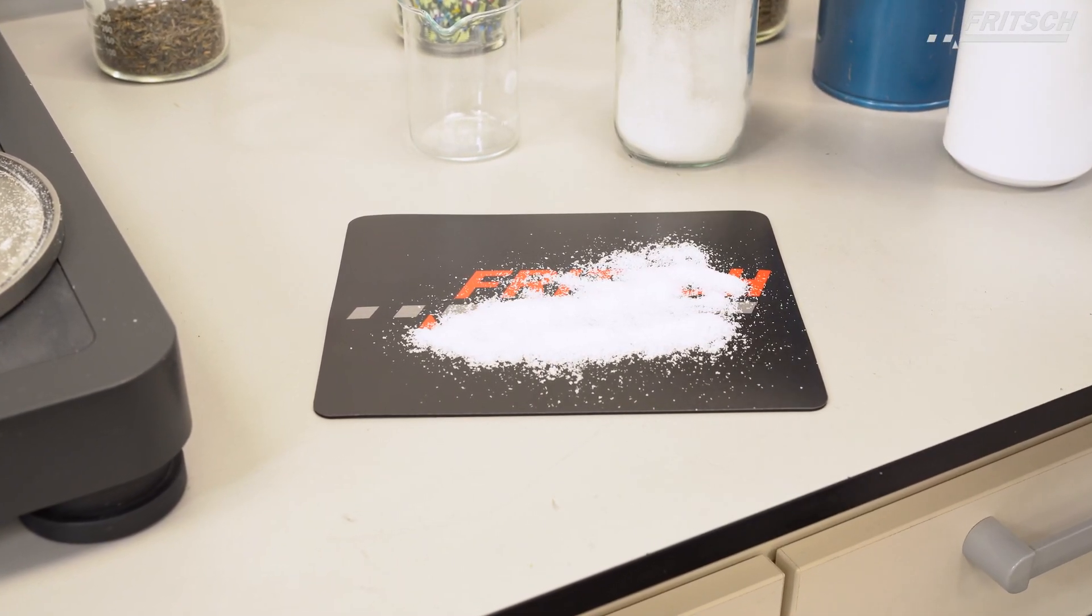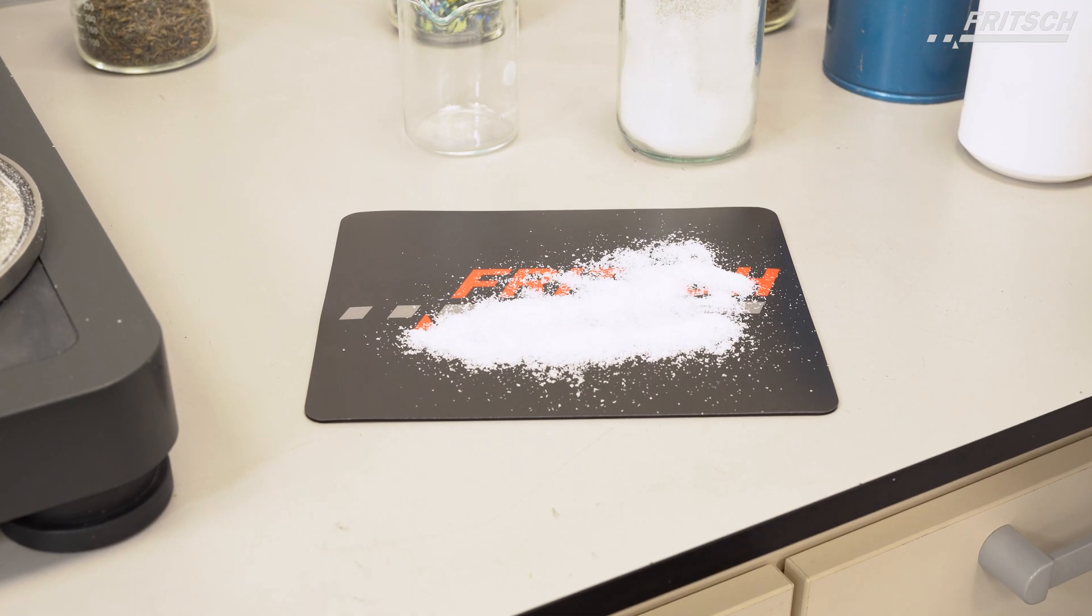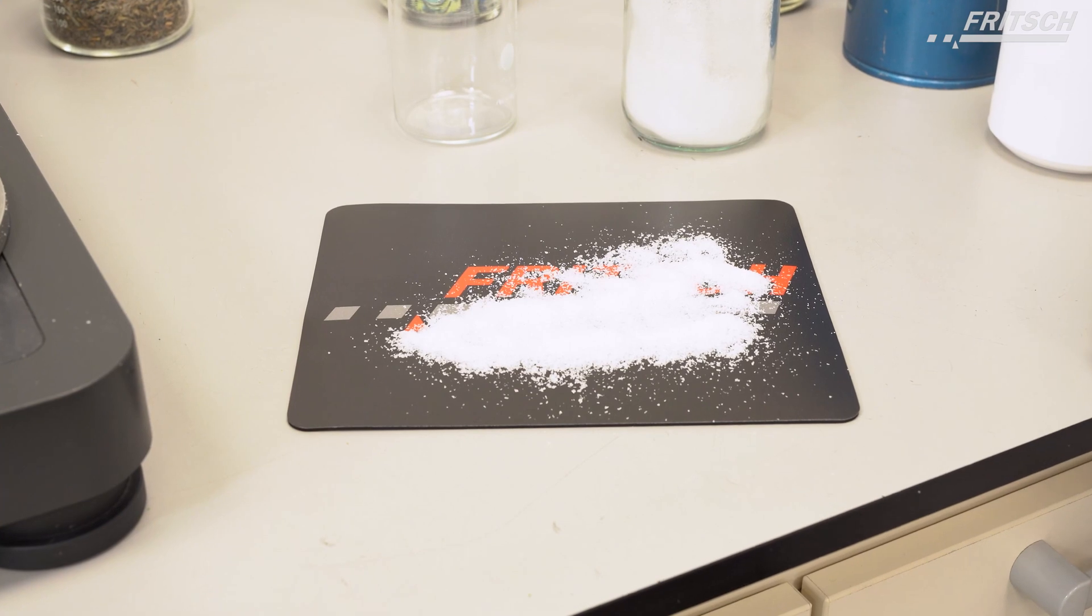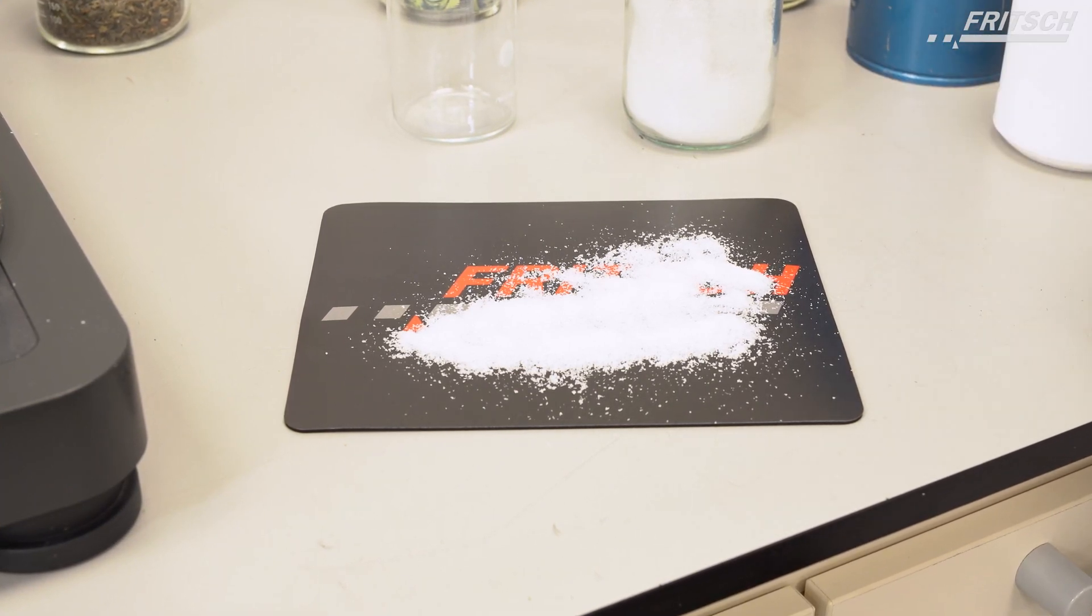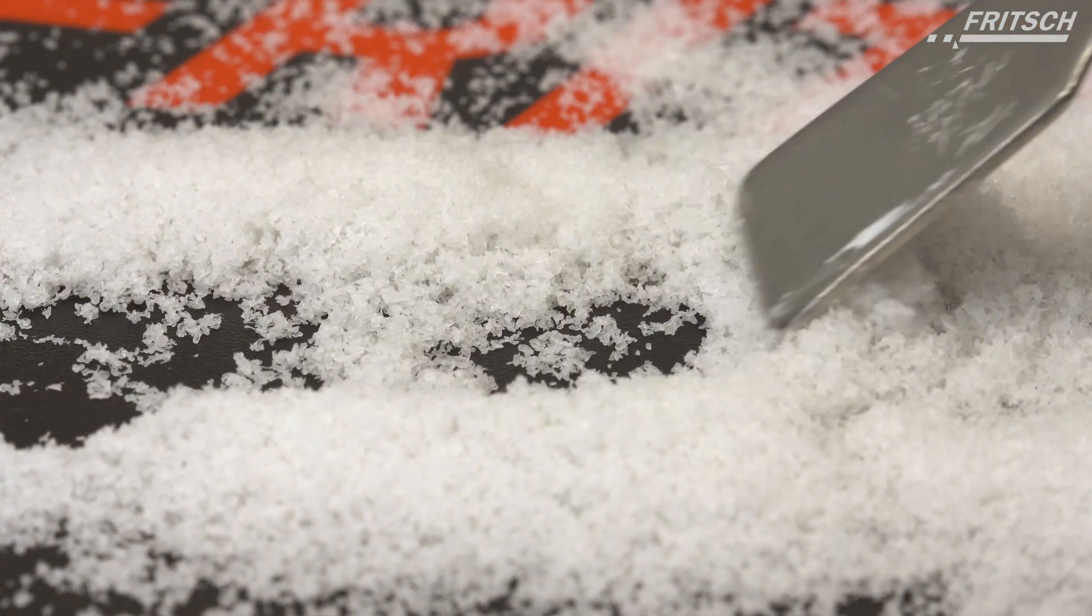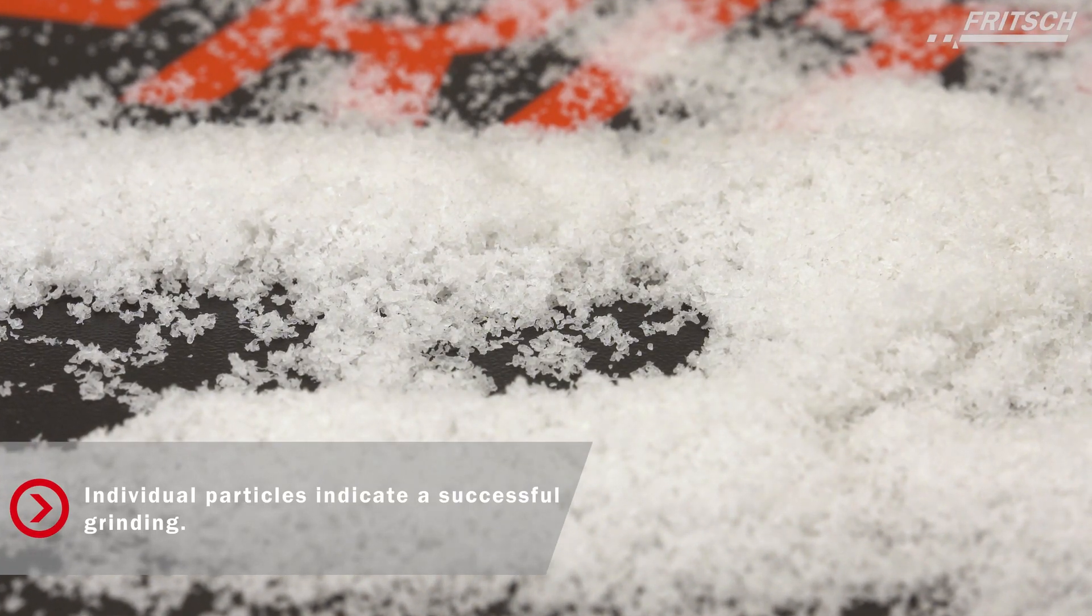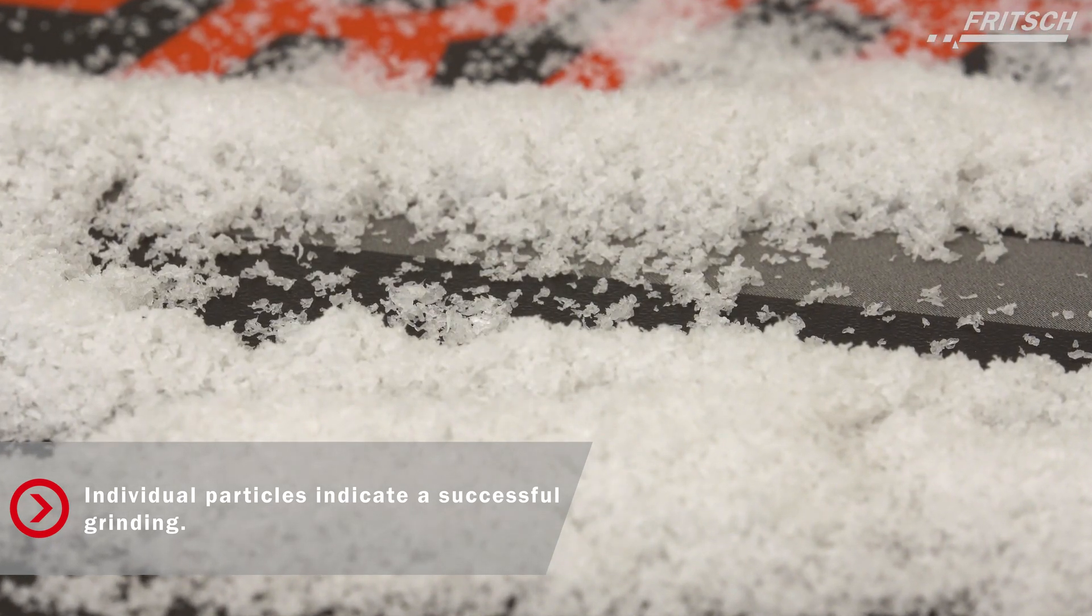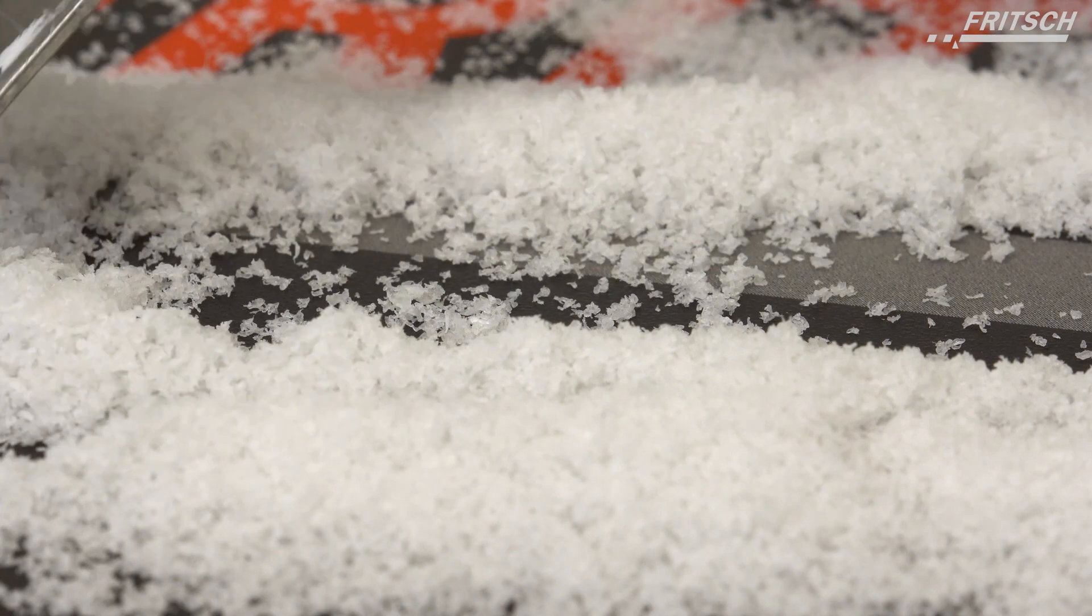We can recommend for this sample this application setting because there is no sticking and no melting of the sample. The particle size we achieved for this sample is approximately 200 microns because this was the sieve size we used, but in fact the sample is finer.